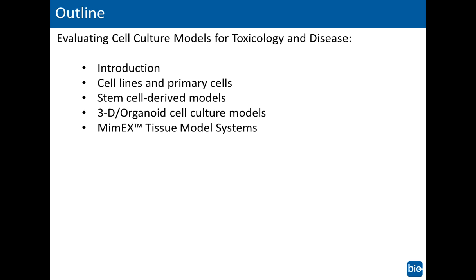So the title of my talk today, or our talk today, is evaluating new 3D systems for disease modeling, toxicology, and drug screening. And the way we're going to do that is through walking through some of the cell culture models that are being used currently for toxicology and disease modeling. And we're going to divide it between Kevin and I.